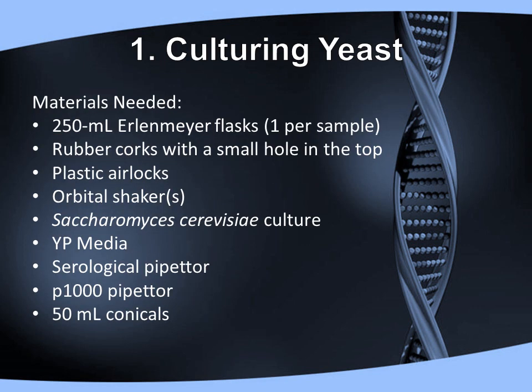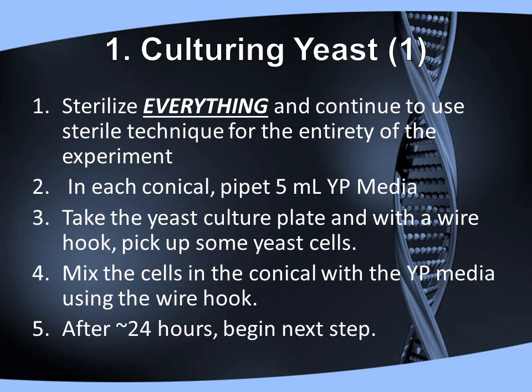Here are listed our materials. You can see that none of them are of any note. It is very important to use sterile technique throughout the entirety of this experiment. You don't want unwanted specimens in your experiment.